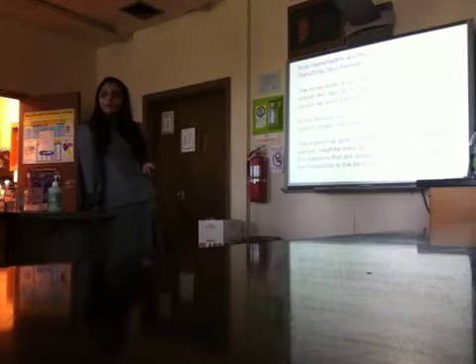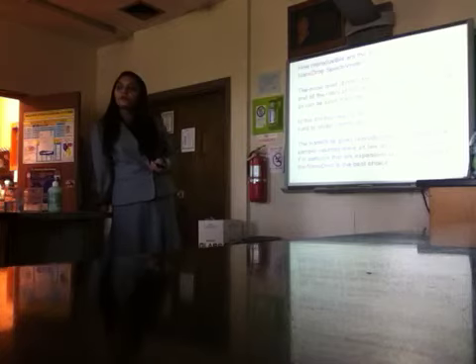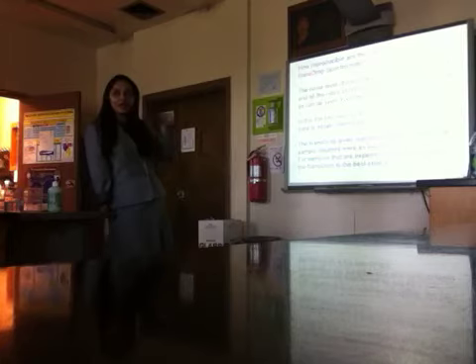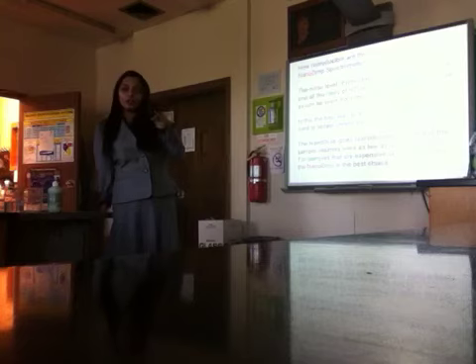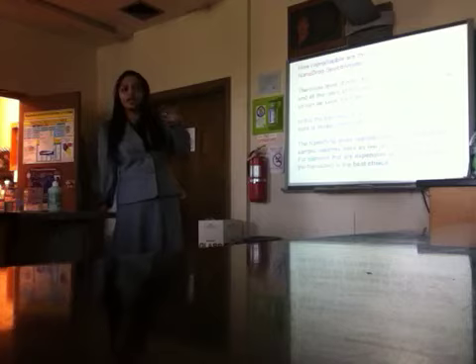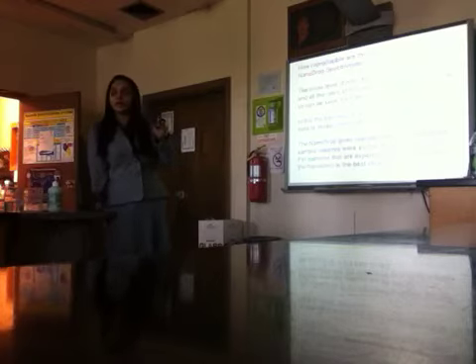But before you even did this experiment, when you just approached the nanodrop to begin with, you tested it even with the control, right? With the control, and with the 100 micromolar concentration. Because when I use 200, it's too big, and when I use lower, then it's not showing anything. So I tried with the 100 micromolar concentration, and I did the same thing. I tried 2 times, 3 times, and like 30 minutes, and it gives me the same absorbance. It's not exactly the same, but it gives me a difference of 0.05 or something. It's not more than that.